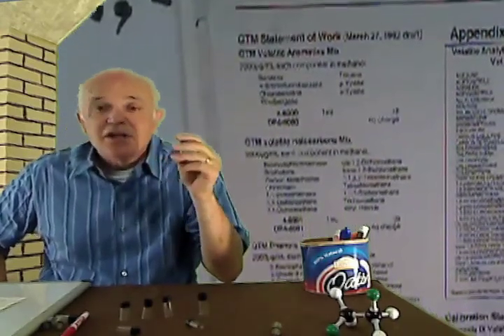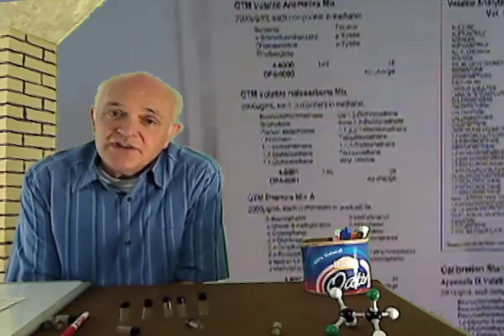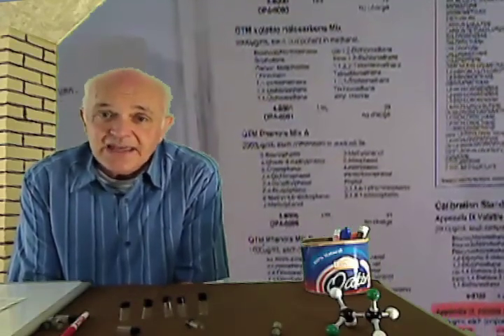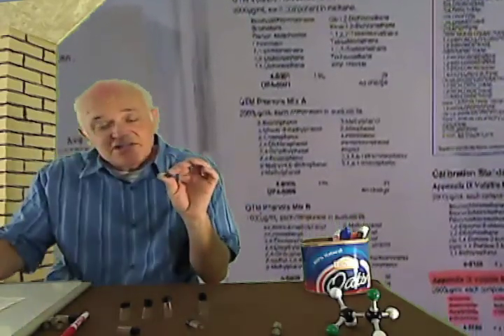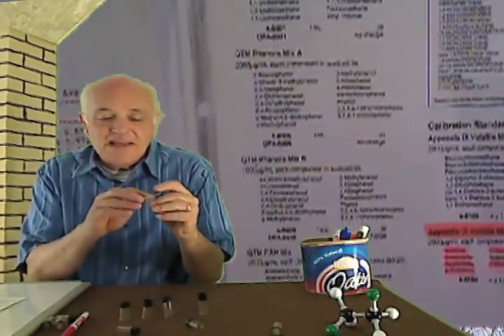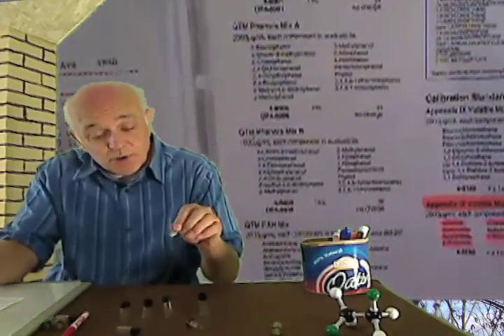autosampler vials. The autosampler vials, the most important label is the primary control number to go into the log for the EPA. This is EPA mandated. Everything has to be documented. So the first thing you do is document the standards for the EPA. They're given an accession number on the jar and then an accession number in a book. And so they would have an accession number, and then maybe a label for what it is and maybe not, and then the description goes into the book.